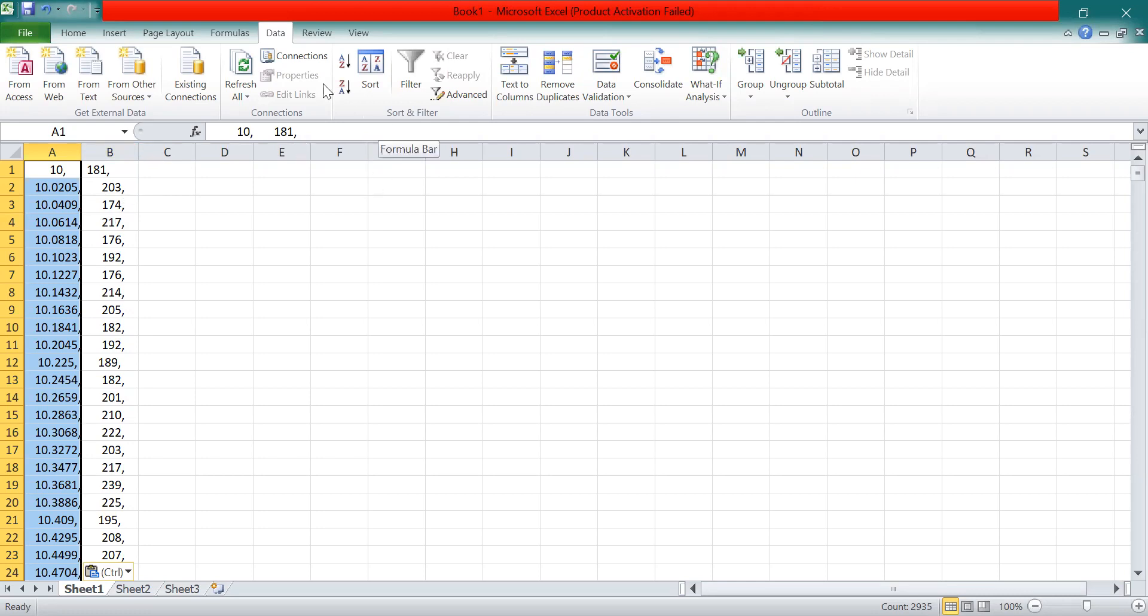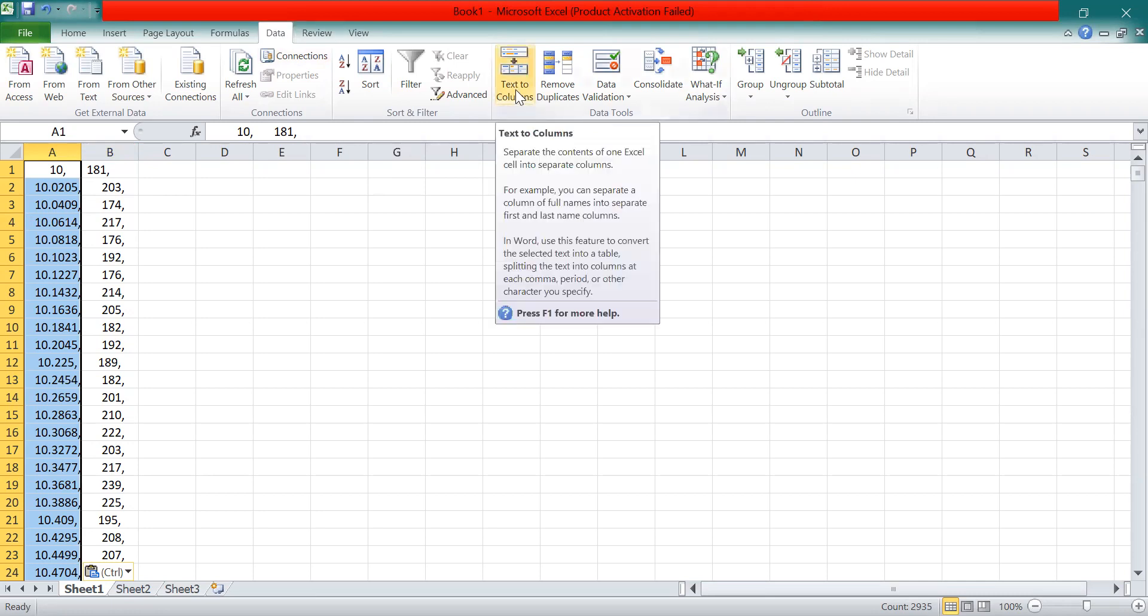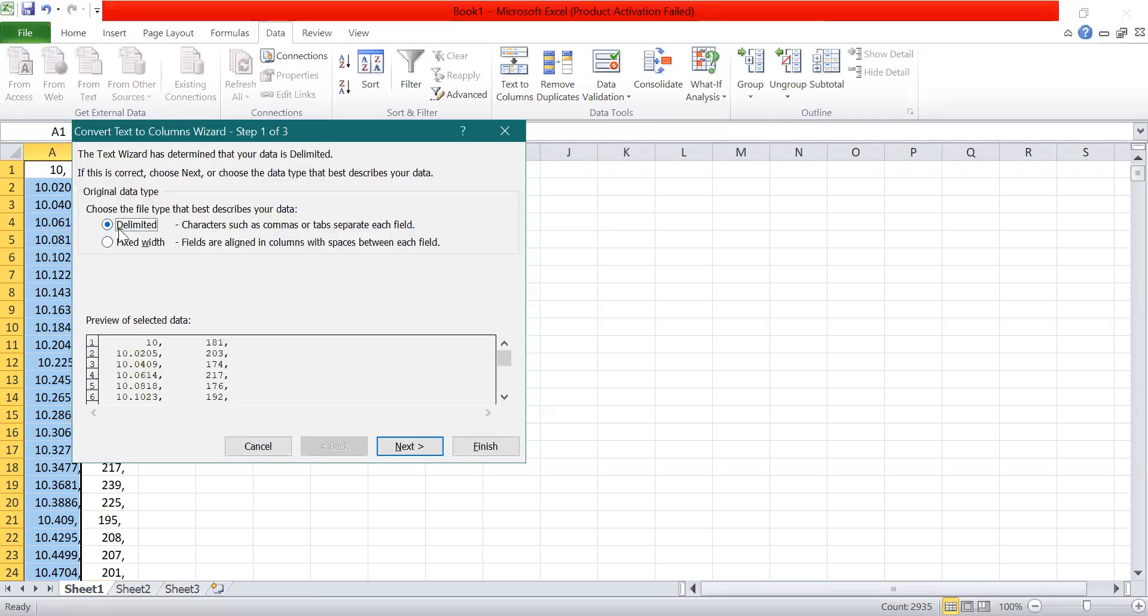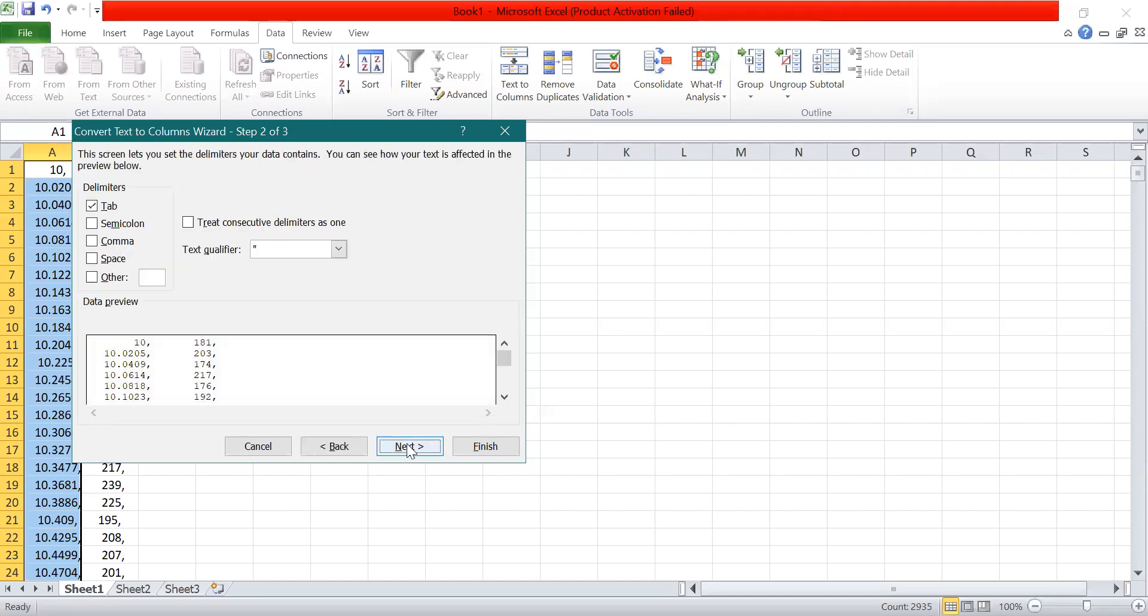For this, I'll click on the Data option, and then there is the option of Text to Columns. Click on that. This is Delimited, already selected, so click on Next.